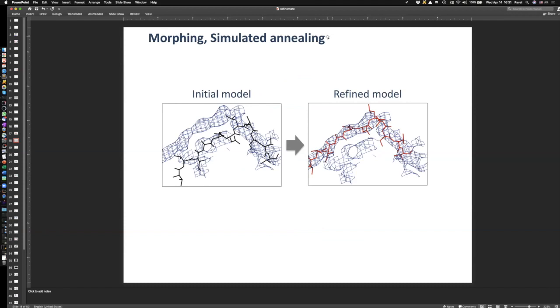Morphing and simulated annealing don't happen by default. They address situations where map and model don't fit very well and a certain large motion can move the model into the map. If you recognize that loops need quite a bit of movement to fit the map, you can enable morphing or simulated annealing as part of refinement. But you need to explicitly ask refinement to do this.